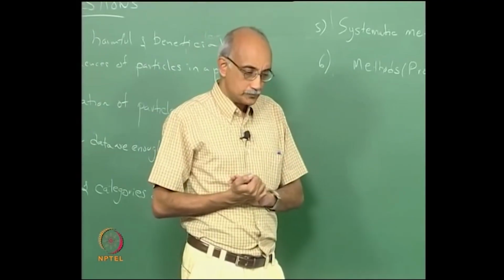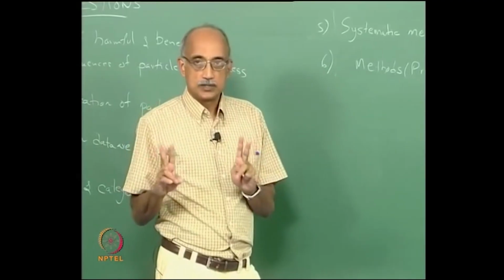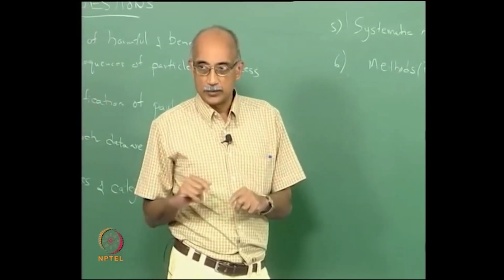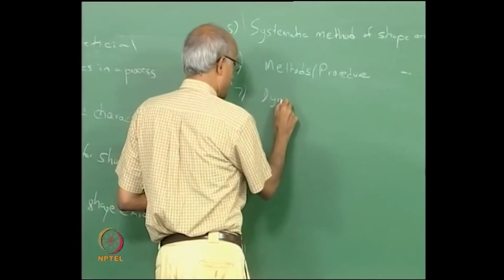However, size analysis in particular is done in two modes, static mode and dynamic mode, right. And so what are some of the dynamic methods of size characterization?